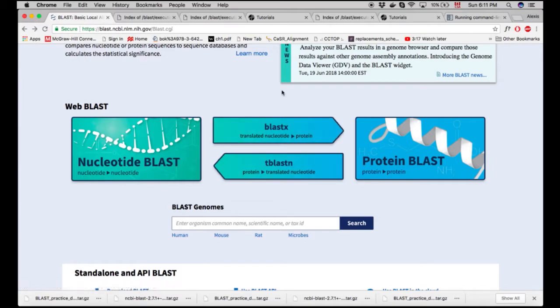If you have a nucleotide sequence and you're interested in BLASTing against proteins, you can use BLAST-X. And the opposite — when you have a protein or amino acid sequence and you're interested in BLASTing against nucleotides — you can use TBLAST-N.